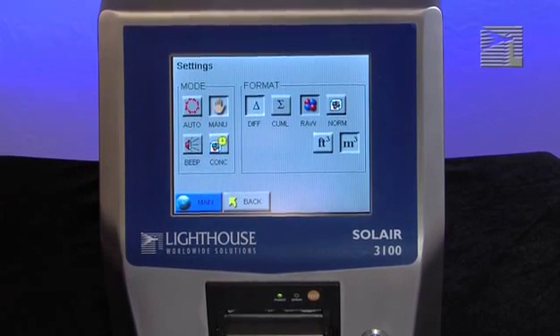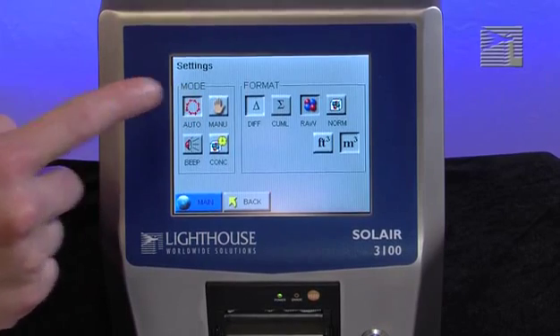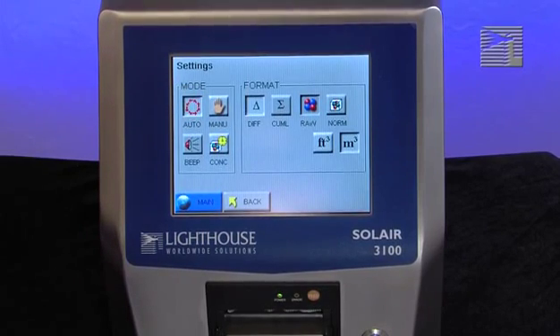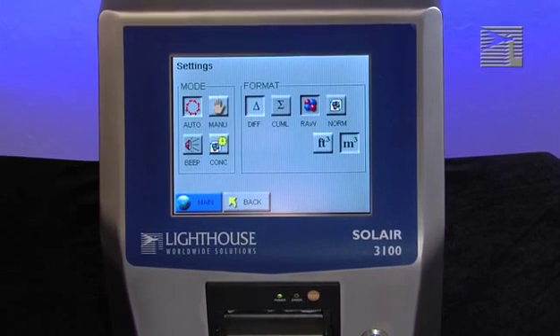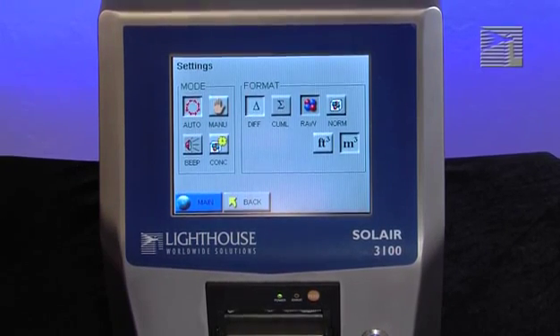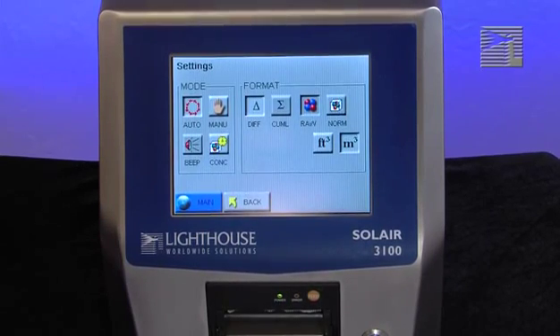When the instrument is in Auto mode, it will start counting particles automatically according to the sample time, hold time, and the number of cycles that are configured. If cycles are set to zero, the instrument will continue indefinitely until the stop button is pressed.